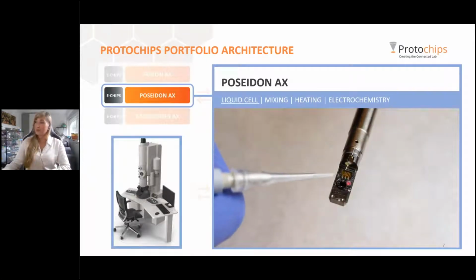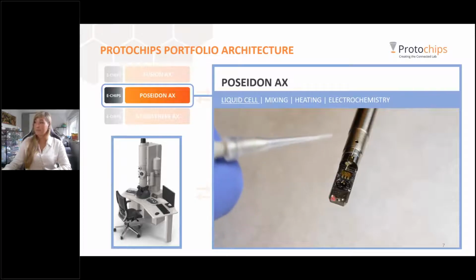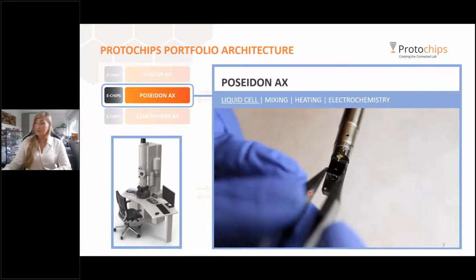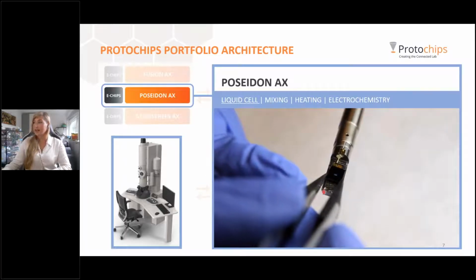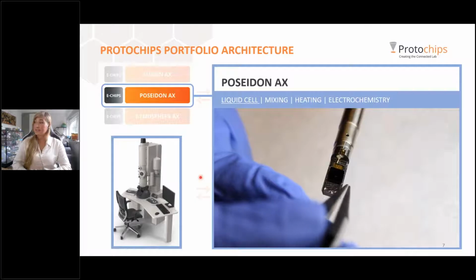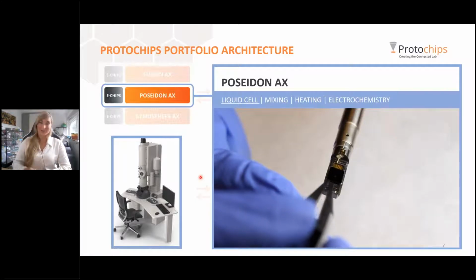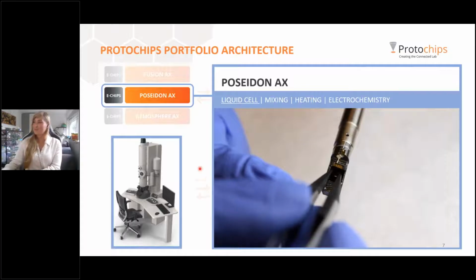You can see here also that she's adding a droplet of water to make sure that there's always liquid in the cell before she can start mixing and flowing things from the outside. The final thing she does is add the top chip in so that everything is nicely sealed together. And the last step is to add the lid and the screws, which I usually think is the most difficult part because they're so tiny, those screws.